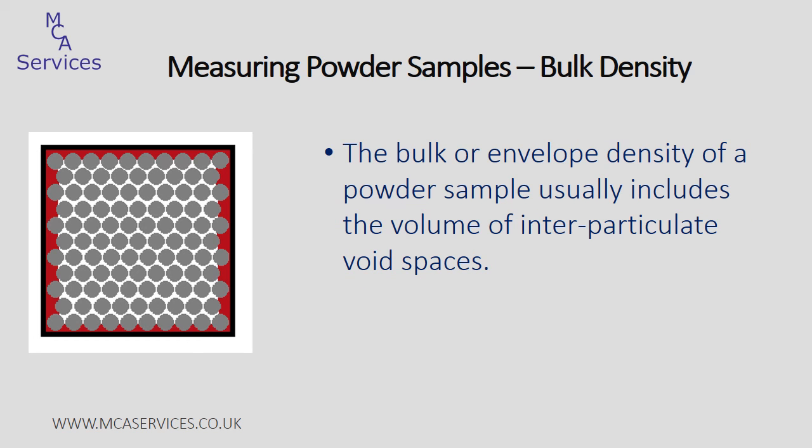When measuring bulk density or envelope density of a powder sample, it's quite common to include the volume present within the interparticulate spaces within the density calculation. Again, the displacement media is shown here in red. The volume is therefore measured to be the envelope volume of the entire bed of powder particles.